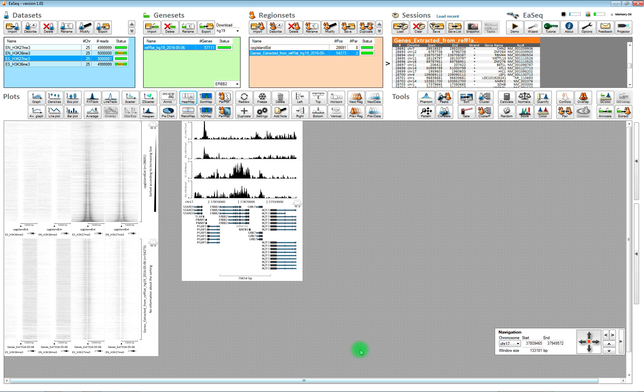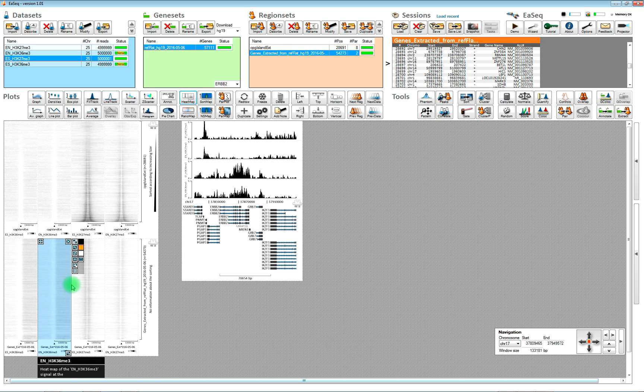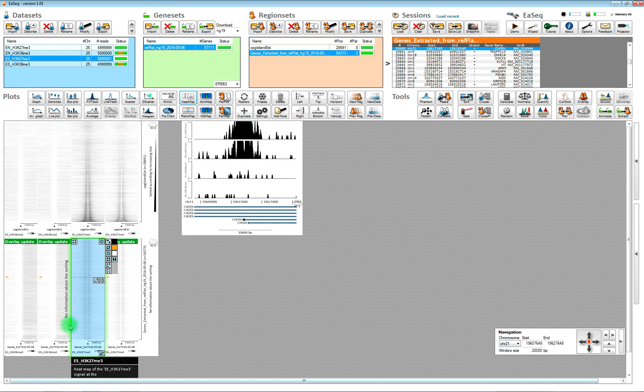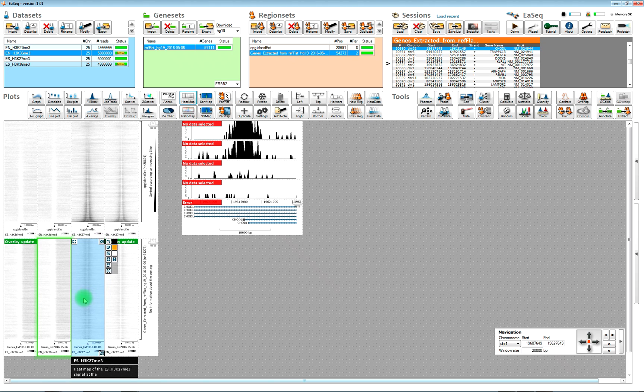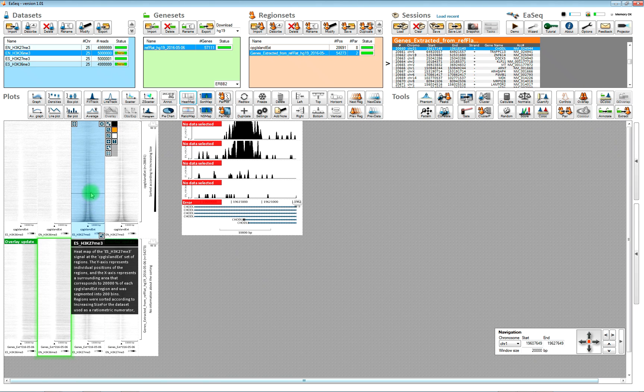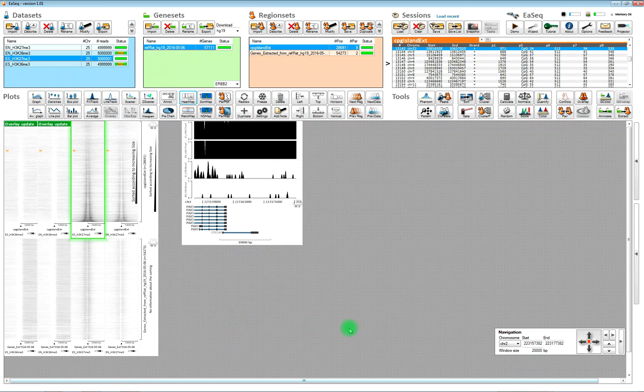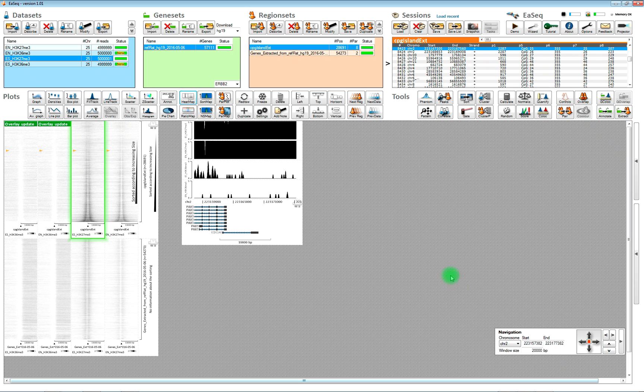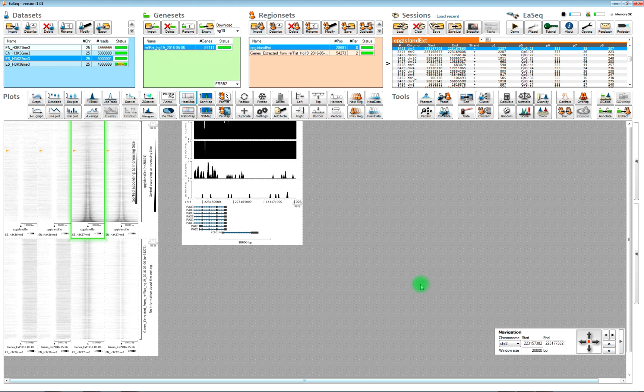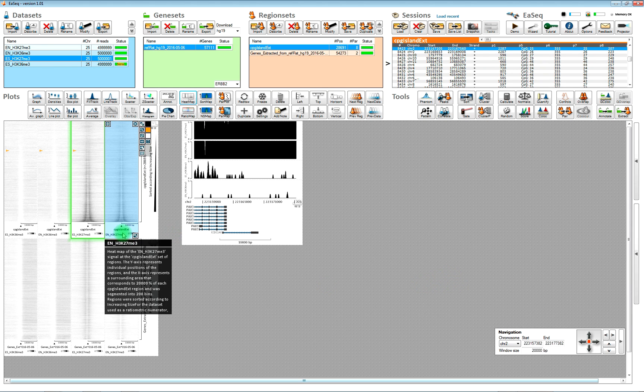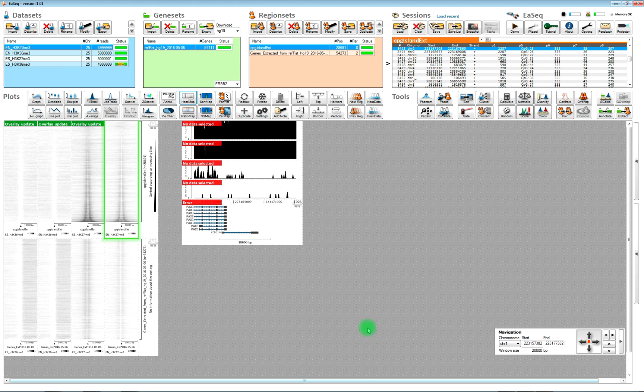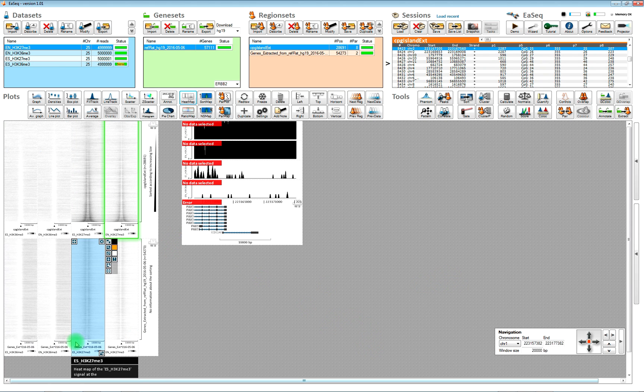And they are of course also clickable just as the other set of regions were. So you can visualize the fraction of regions that you would like to.